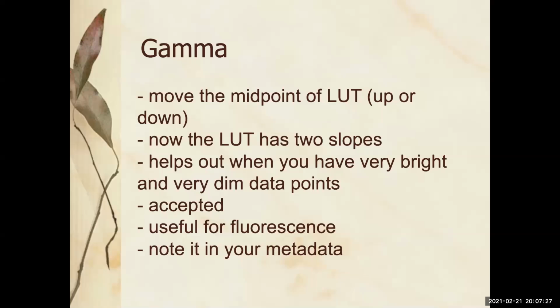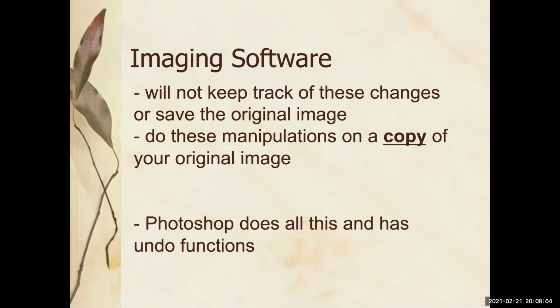And like I said, keep track of it in your metadata, in your imaging notebook. Some computer software will keep track of the changes you've made, but most of it doesn't. And even if it keeps track, it only keeps track until you save and close it out, and then you reopen it and it's like, what? I have no idea. This is the first time I've ever seen this image. So this is why, for now, the imaging log is really important. Don't trust the software unless you know for sure that it keeps track of everything for you. And even then, just get in the habit of putting everything in your imaging log. It only takes a second.